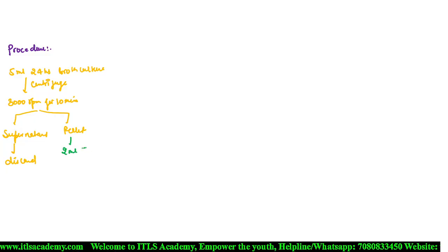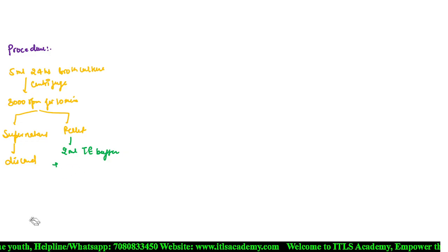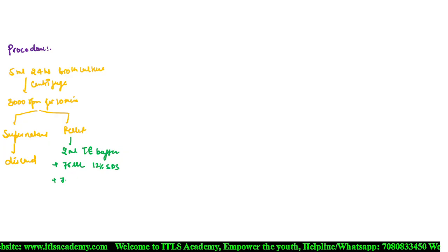TE buffer, that is your Tris-EDTA buffer, plus 75 microliter of 12% SDS plus 7.5 microliter lysozyme.